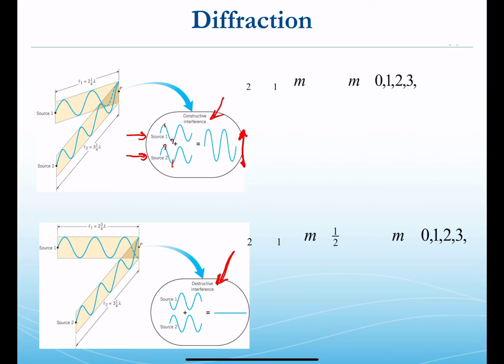As you see here, this wave is twice as tall as the two separate waves prior to interference. However, if these waves are out of phase, where peaks are not aligned, and in perfect misalignment, that is, the peak of one wave is aligned with the well of the other, we see that continuing here, we will get the condition for perfect destructive interference, and the waves will cancel. And so there'll be no resulting wave.